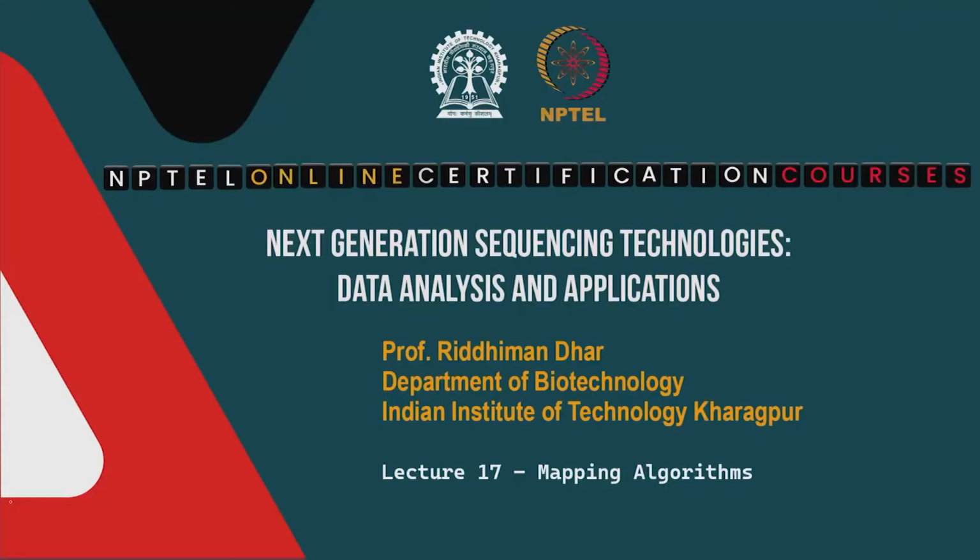Good day everyone, welcome to the course on next generation sequencing technologies, data analysis and applications. In the last couple of classes, we discussed some of the methods that could allow us to do read mapping. We talked about different ways we can do this, and we looked at the drawbacks of those methods. In this class we will continue our discussions on two different mapping algorithms. This class will give you an overview of the process by which we can do the mapping.